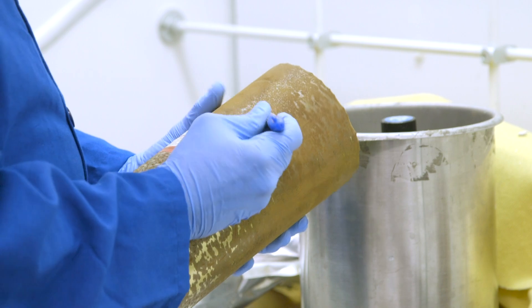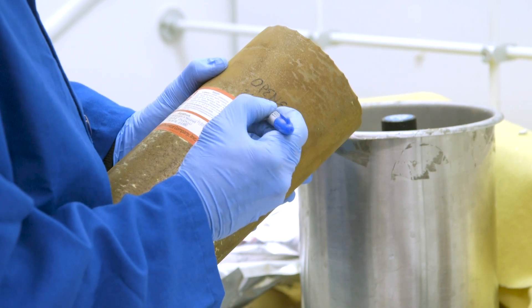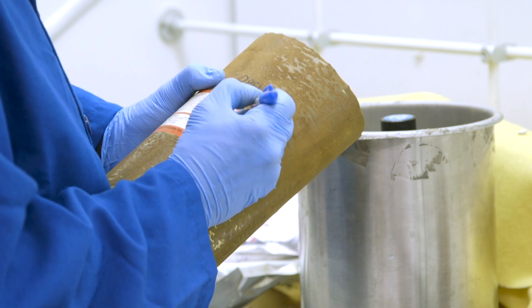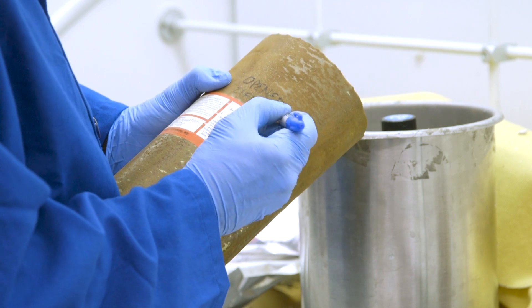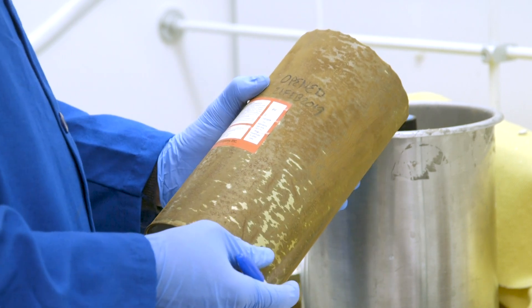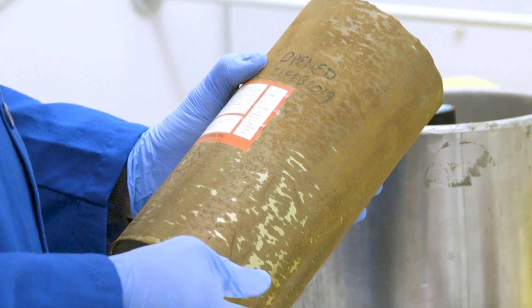Bottles will not be kept in storage for periods longer than one month after their initial use. Bottles exceeding this date will be removed as hazardous waste. Perform a visual inspection of the septa prior to use to verify integrity. If the septa is compromised, consider disposing of the reagent or transferring to a new container. Remember, pyrophorics can be unpredictable.